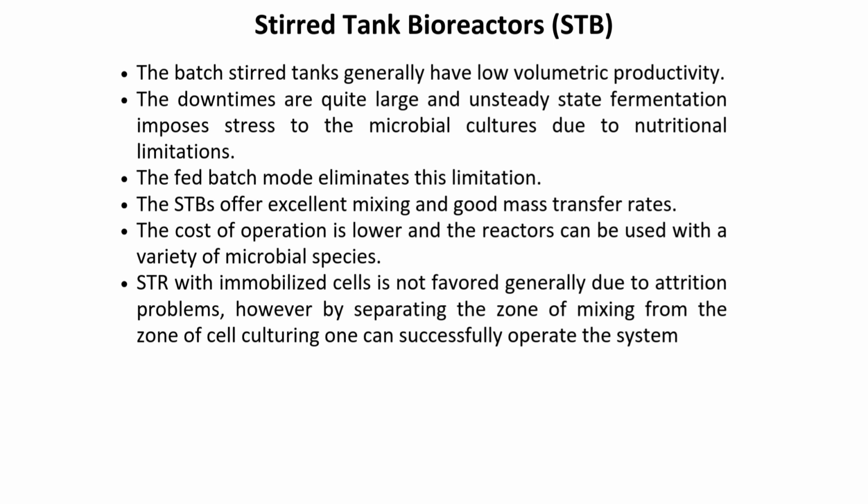On the positive side, STBs offer excellent mixing and good mass transfer rates. Their operating cost is lower, and they can be used with a wide variety of microbial species. Using an STR with immobilized cells is not generally favored because the stirring causes attrition or wear and tear on the particles. However, by physically separating the mixing zone from the cell culturing zone, it is possible to successfully operate such a system.